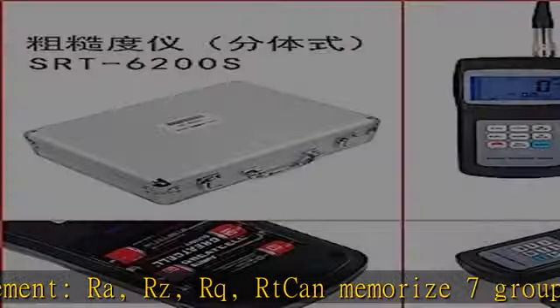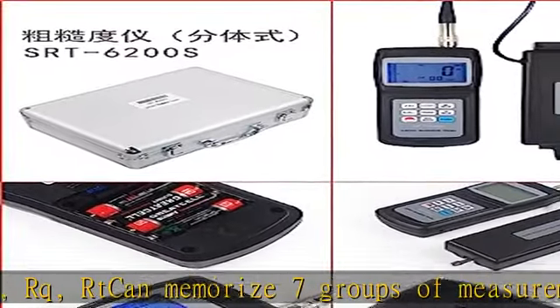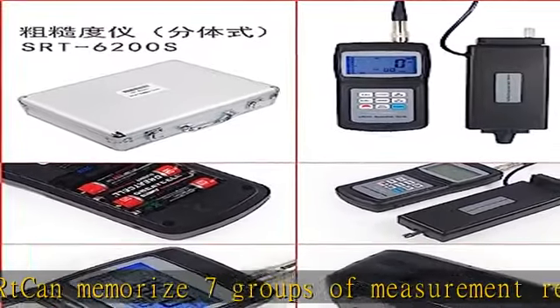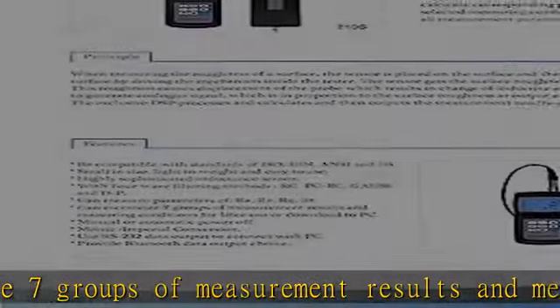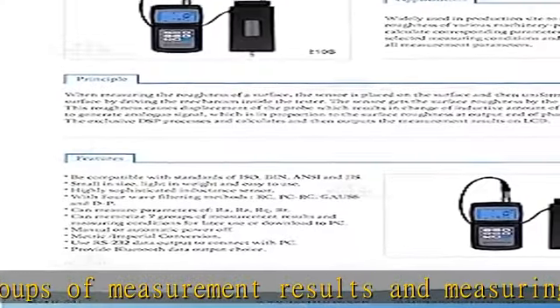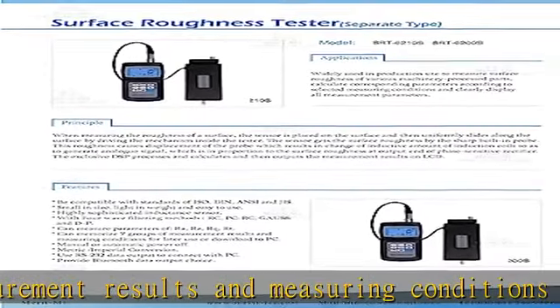metric/imperial conversion. Use USB/RS-232 data output to connect with PC, provide Bluetooth data output choice.